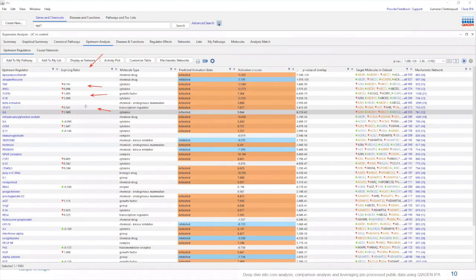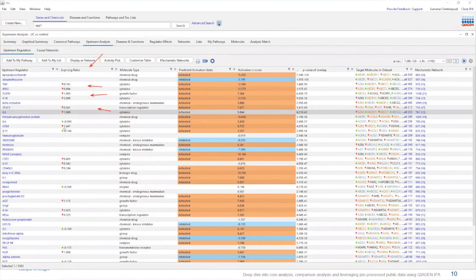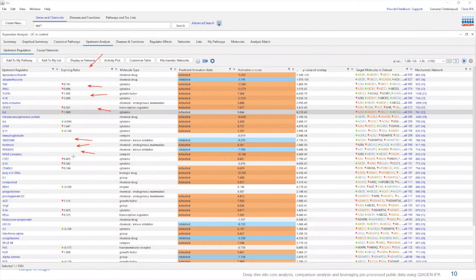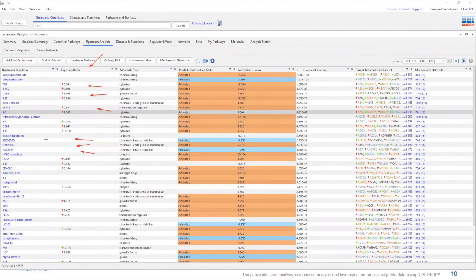You can see we have small up arrows and down arrows, green colored and red colored ones. They tell you whether these genes were up regulated or down regulated in your data set. Now the rest of the regulators that are shown in the table, they do not have any expression value. So these regulators are coming from IPA's knowledge base. And based on the knowledge base, it indicates that these regulators target some of the genes within your data set.